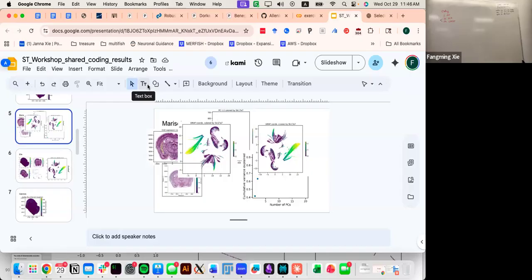Oh, that's because I didn't do UMAP equals this, so I should do exactly the same thing. Okay, 10 by 2. Okay, 102. So let's try 1,000 rows, does it work through? Yeah, 1,002.